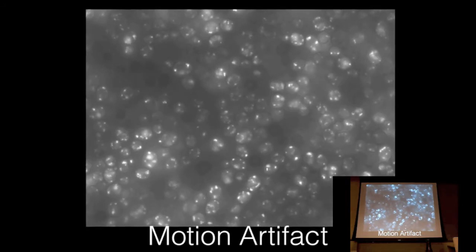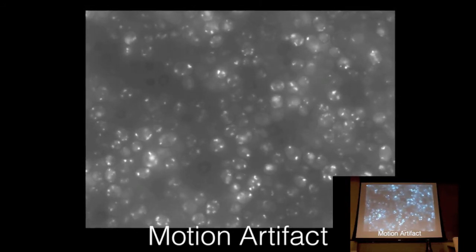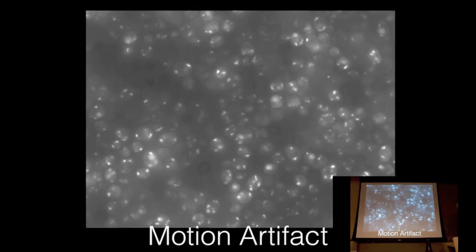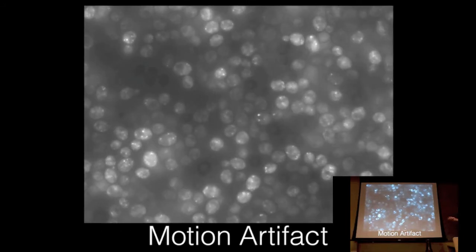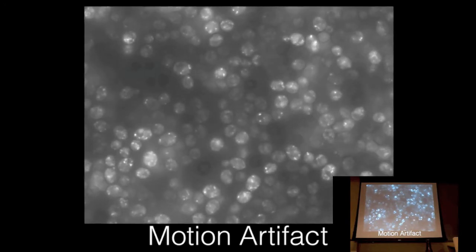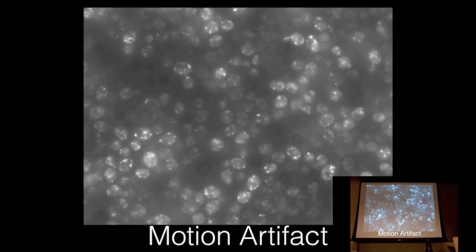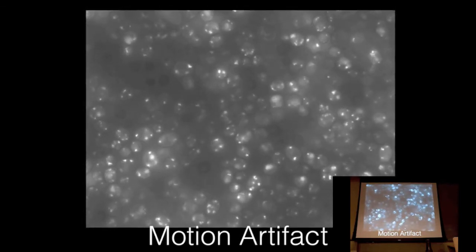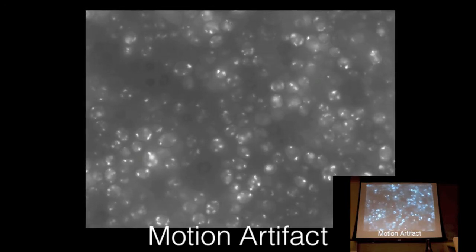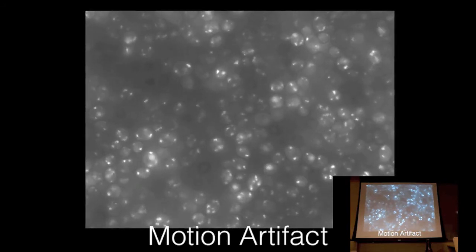It's a heated chamber. But initially you had the cells off the heated chamber, and then you put them on the heated chamber. And so what's happening here is that as you collect the movie, the whole system is reaching thermal equilibrium, and that's causing these slower drifts in the stability of the system. So this is an example of, well, okay, I could try to correct for this, but not really, right? Basically the data is getting taken from the wrong focal plane.